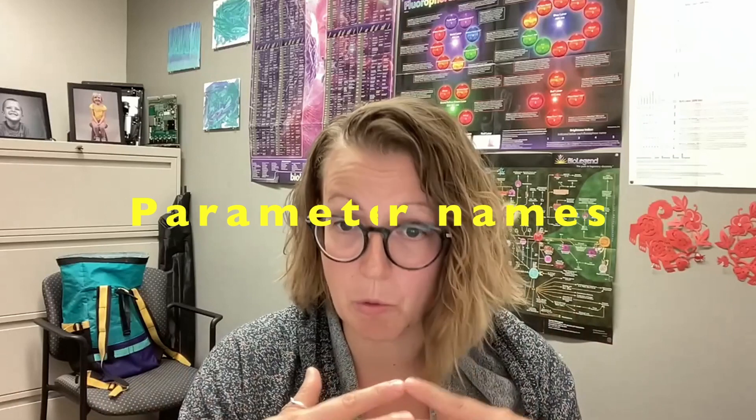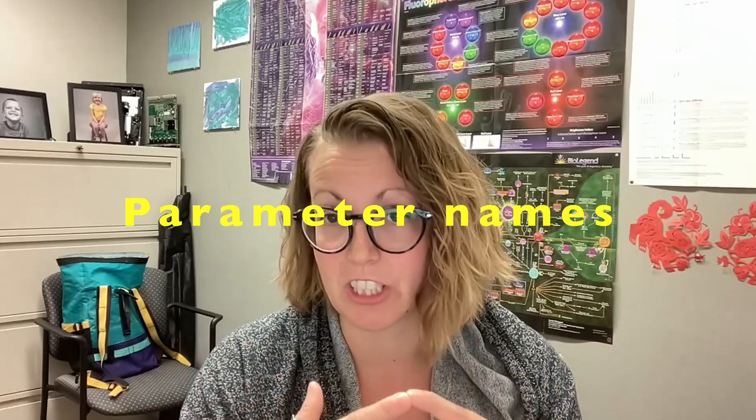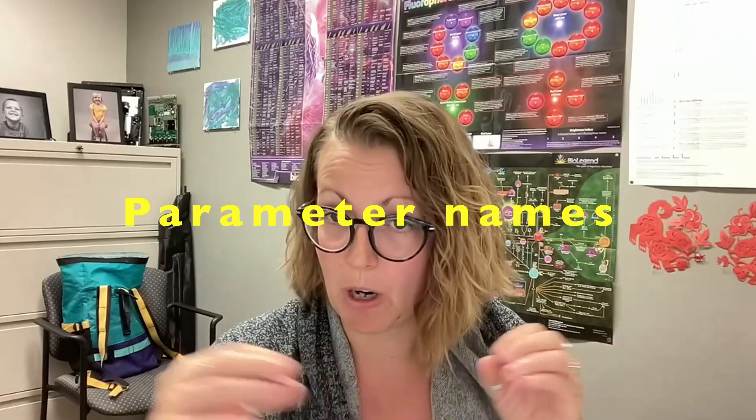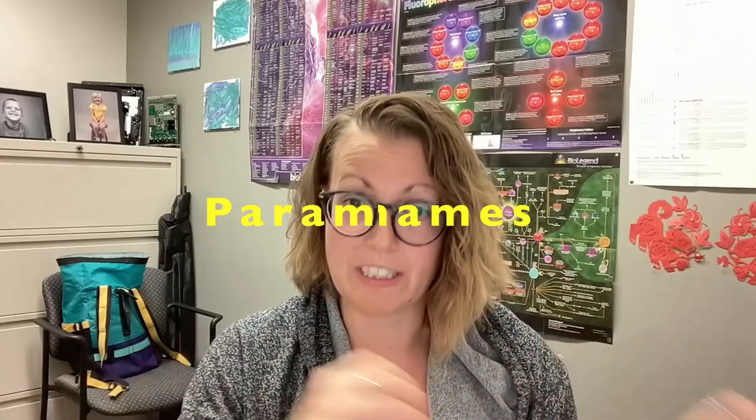The second thing to keep in mind is if you're running these studies between different machines batch correction or cytonorm needs to have the exact same parameter names in order for it to function. So if you are running between different institutes or between different instruments make sure that you've also standardized all of your parameter names or you will not be able to apply this algorithm to your data.